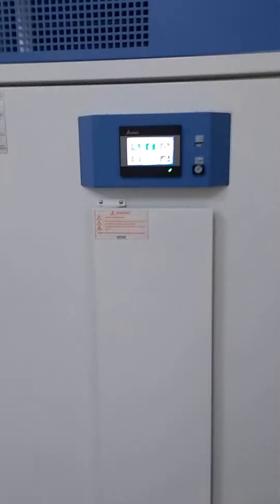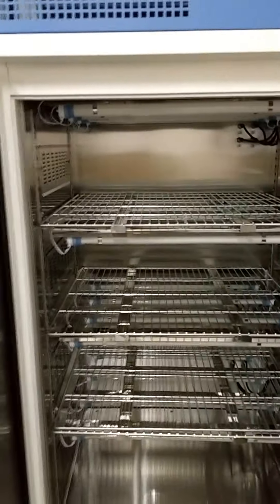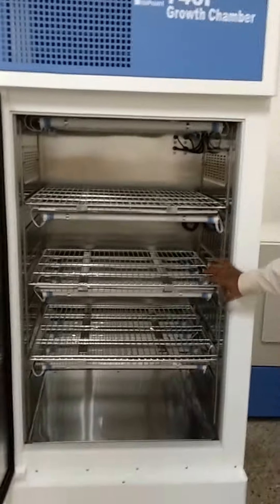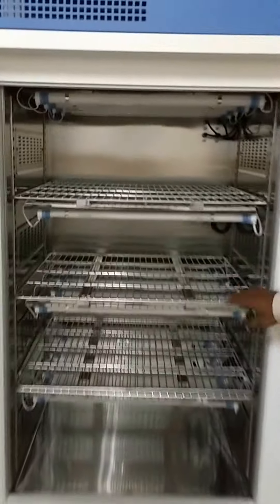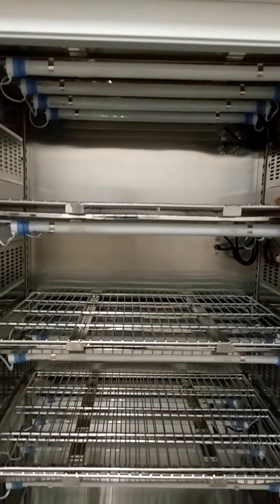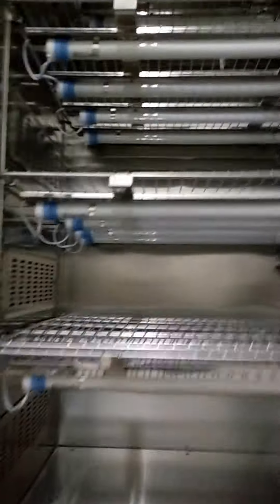Coming to the interior filter, it has four shelves equipped with 48 lights. Individual tubes can be monitored with the HMI port.